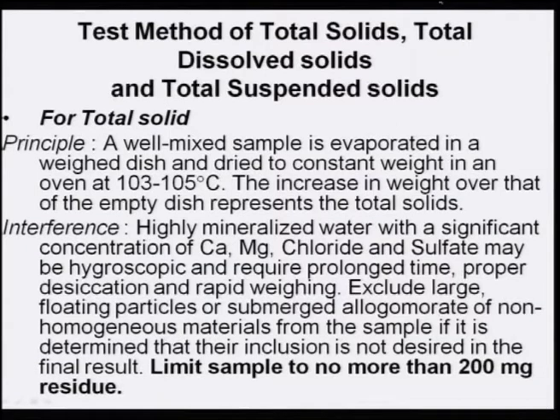Interferences: highly mineralized water with a significant concentration of calcium, magnesium, chloride and sulphate may be hygroscopic and require prolonged time, proper desiccation and rapid weighing.